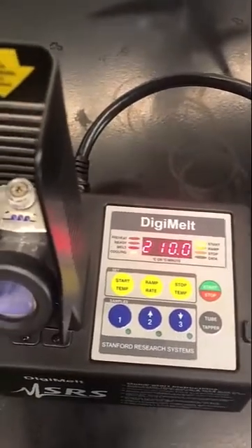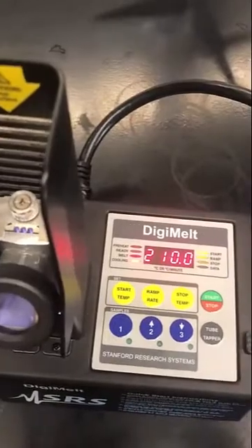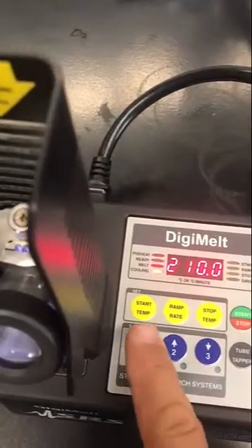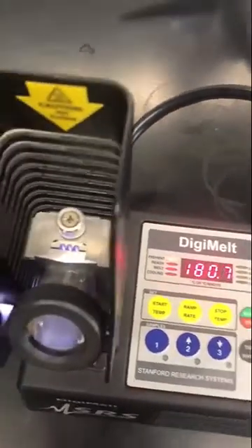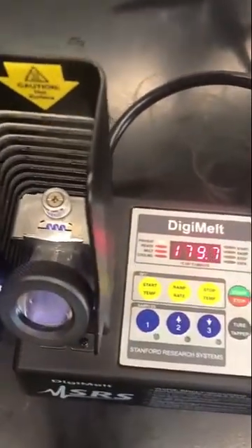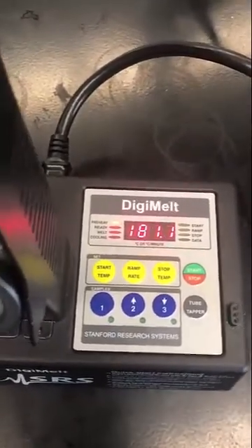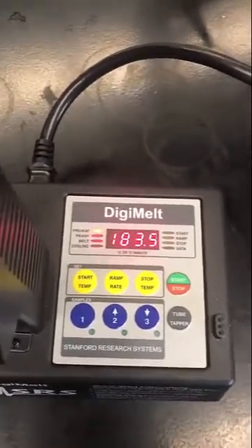For known samples that are pure, you can start 4 or 5 degrees below, but for samples that you produce in the laboratory, typically you do a little bit further down. Once I have the start temperature set, I can hit start/stop and it'll begin to preheat, ramping up to the desired temperature. It goes pretty quickly, but I'm going to pause and we'll come back when it's at 210.